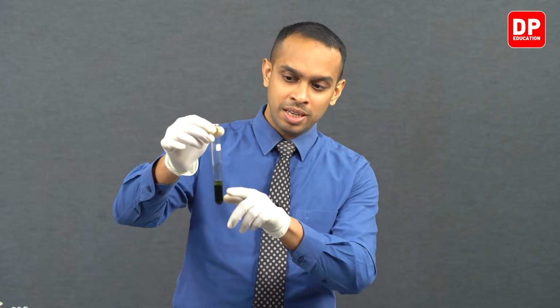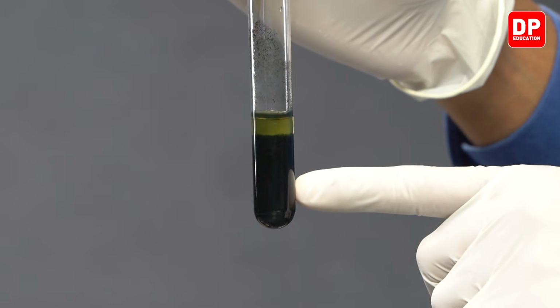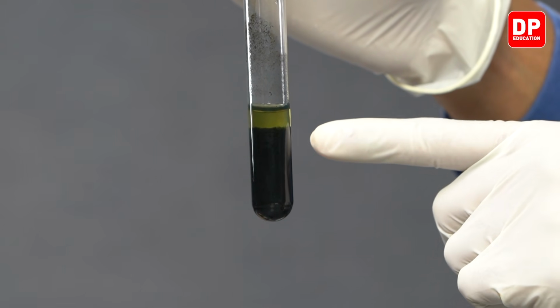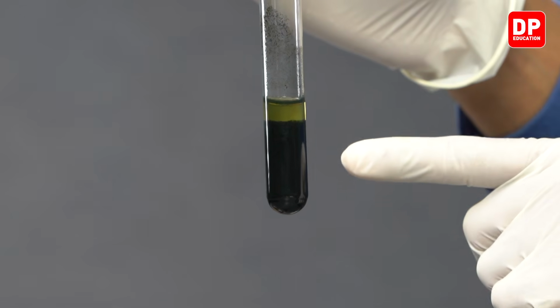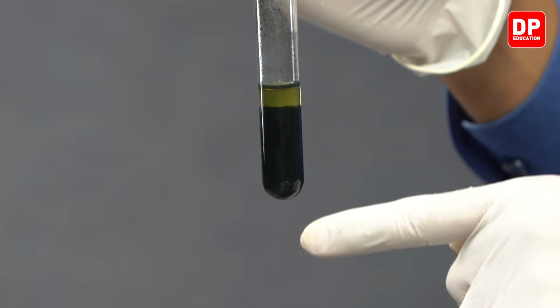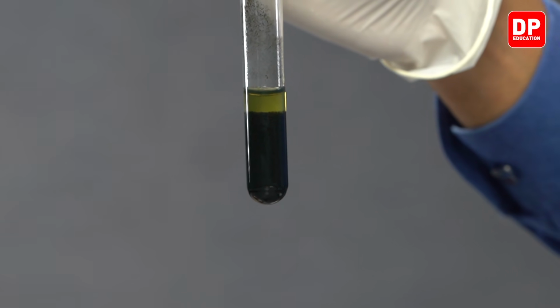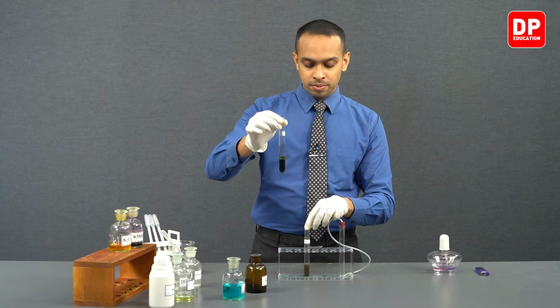So this, you can see the black color precipitate is now starting to get collected at the bottom. We have produced a black color cupric sulfide precipitate here. So what you see here is a black color cupric sulfide precipitate.